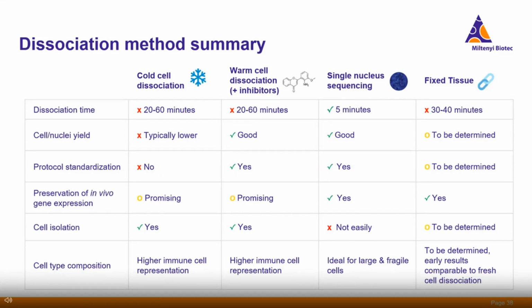So let's say speed was really important to you. If that's the case, then extracting nuclei is a clear winner, though if your nuclei suspension needs cleanup, this might change the situation. If you are working with very small amounts of tissue, then cell yield will be a big concern for you. In this case, you should try either nuclei isolation or warm enzymatic dissociation first.